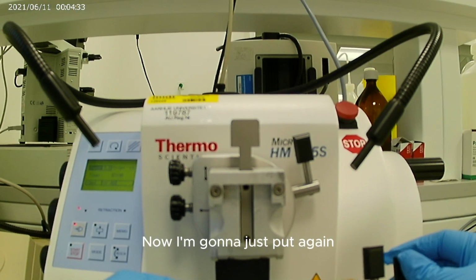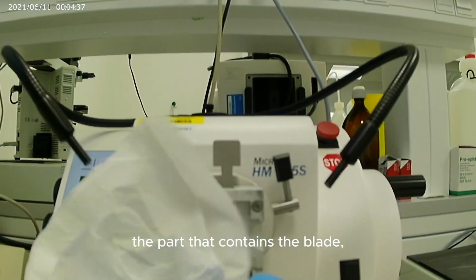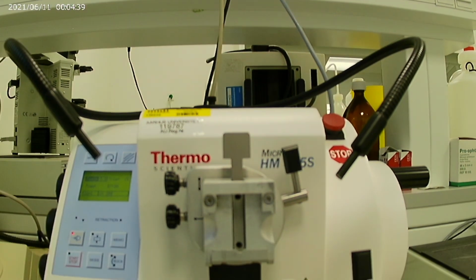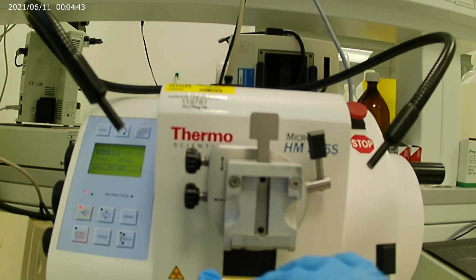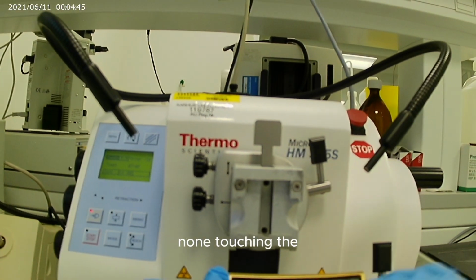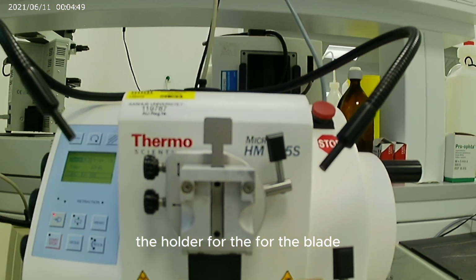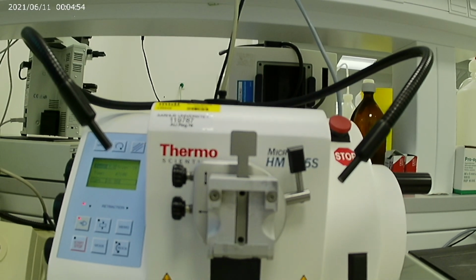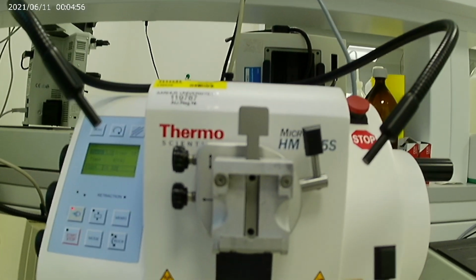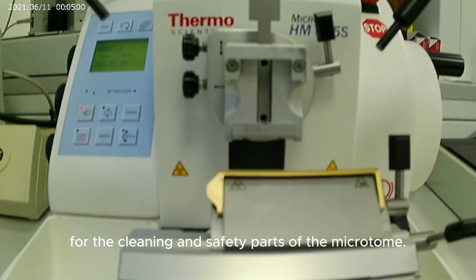Now I'm going to put the part that contains the blade back, and I'm going to clean it, not touching the holder for the blade. And that's all for the cleaning and safety parts of the microtome.